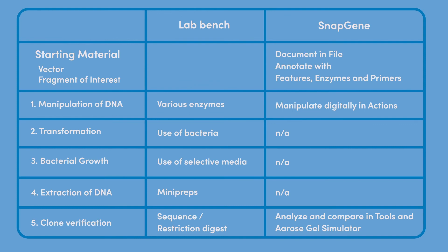Under the Actions menu, there is an array of tools which allow you to design and plan your cloning project in silico, allowing you to gear up to manipulate your DNA. Under the Tools menu, Alignment and Agros gel simulation options help you complete the crucial final step of validating your molecular clone.